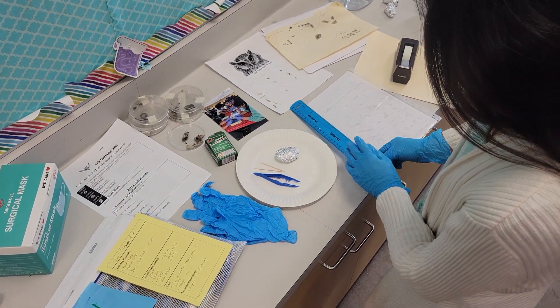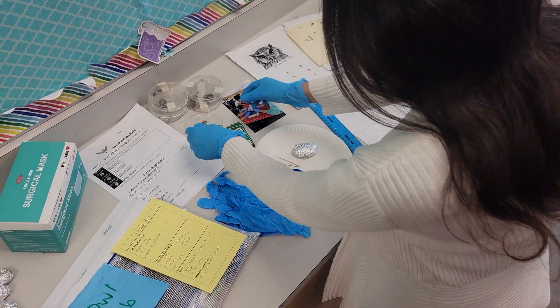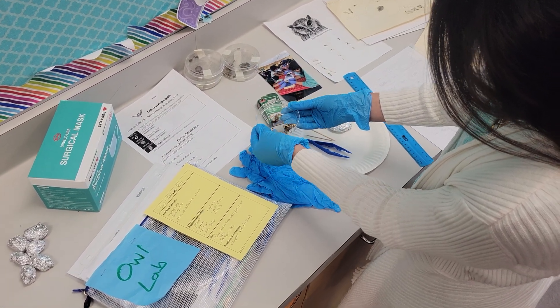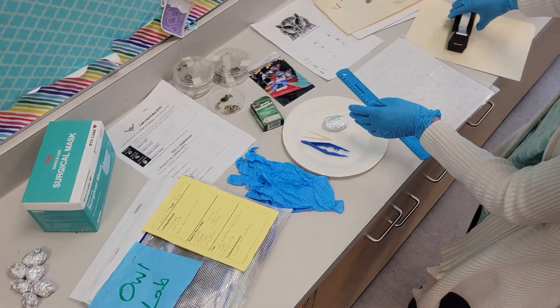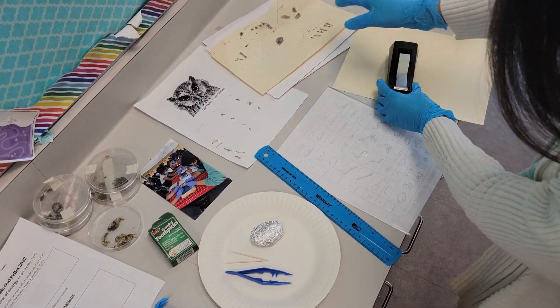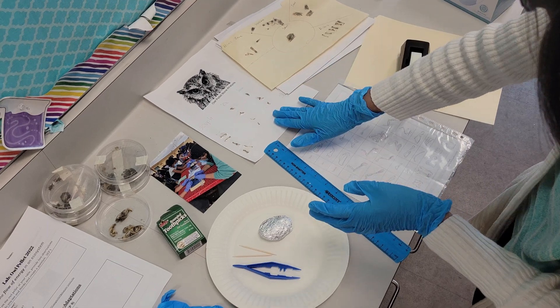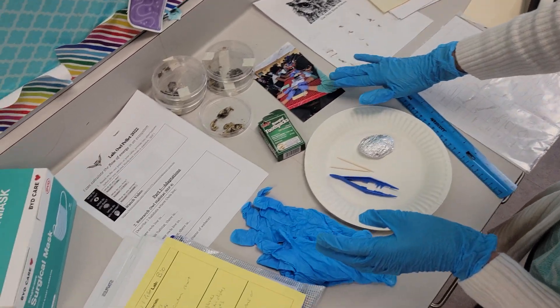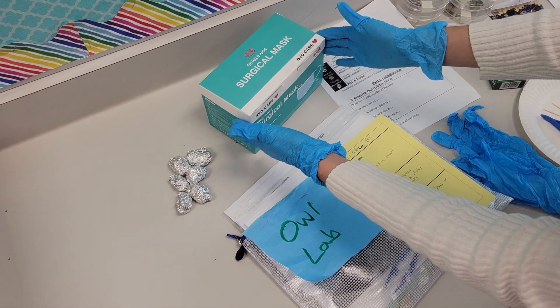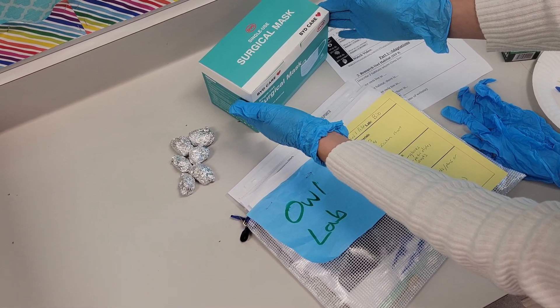Once they've gone through and separated all the fur and dirt from the bones, you want to make sure you provide some tape and a file folder for them to create their project — a visual highlighting all of the bones they have discovered. We also recommend providing the option of using masks, especially for students that might have some sensitivities or allergies.